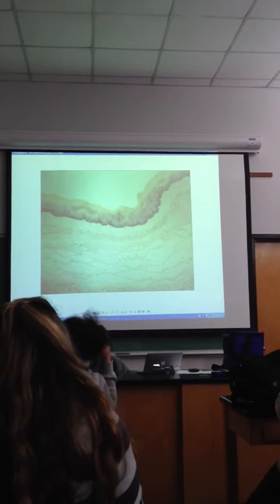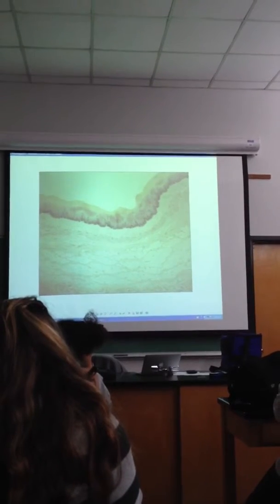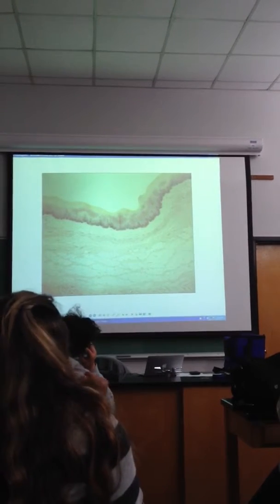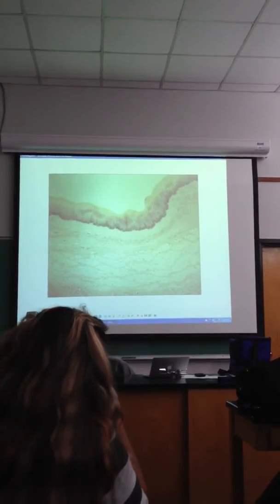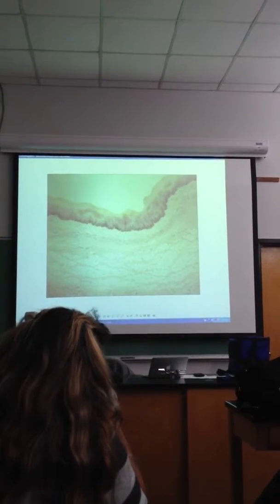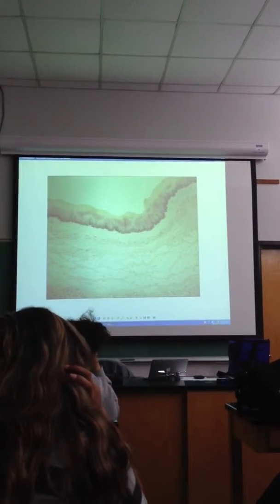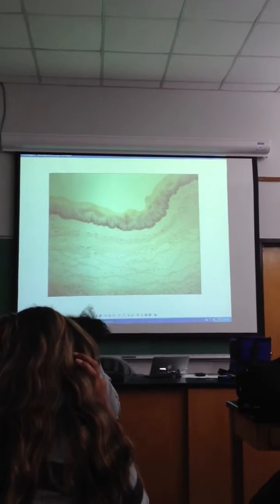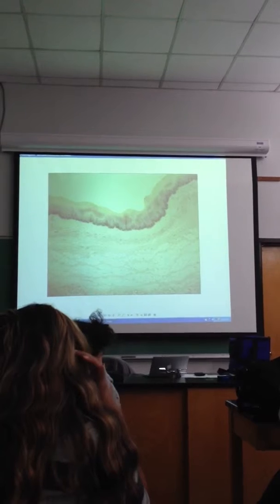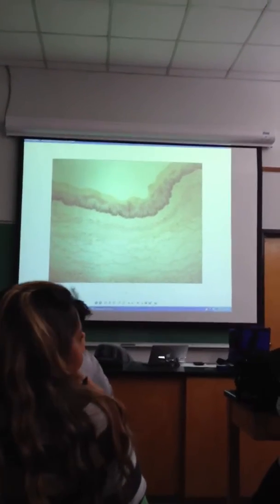Like I told you earlier in class, do not try and simply memorize what this picture looks like. Stratified squamous epithelium can look slightly different depending upon the particular preparation that you have. So the concept is key here. I can't guarantee that the slide you see on your test will look exactly like this. In fact, I will guarantee you it probably won't, because the slides get damaged, they get moved around, and the esophagus is an esophagus, and how do we know? You have to have stratified squamous epithelium. So you need to really lock down those tissues if you haven't previously done so.